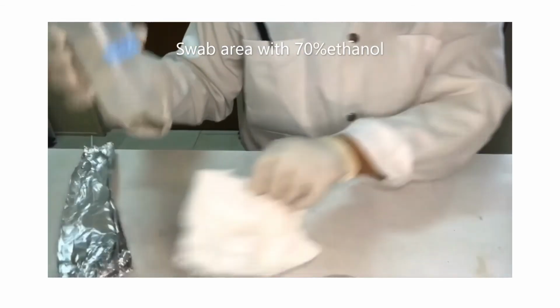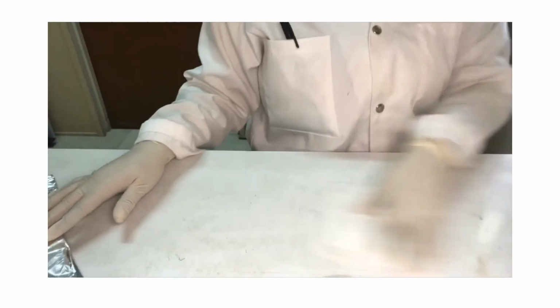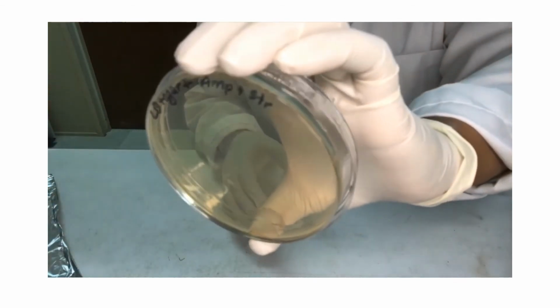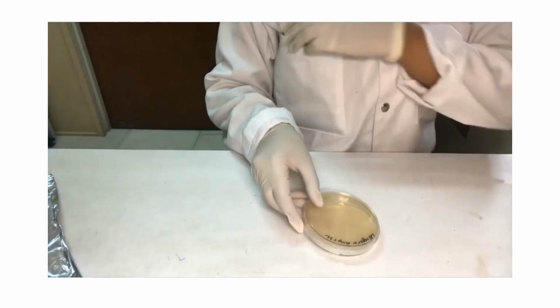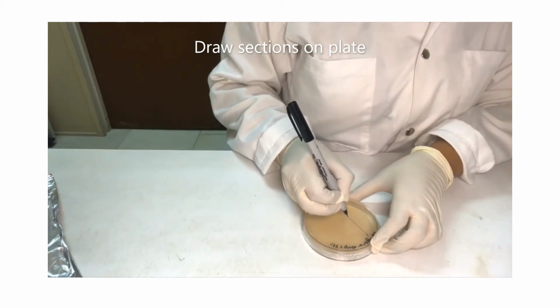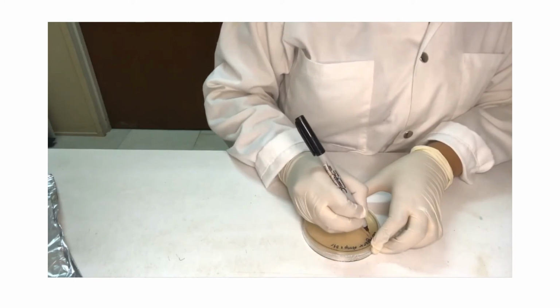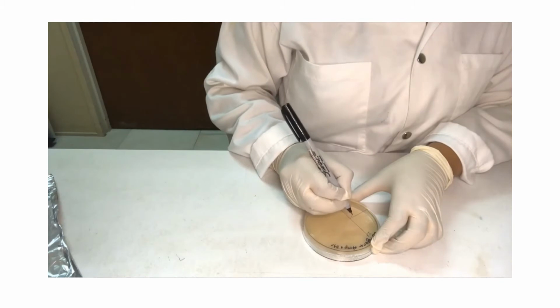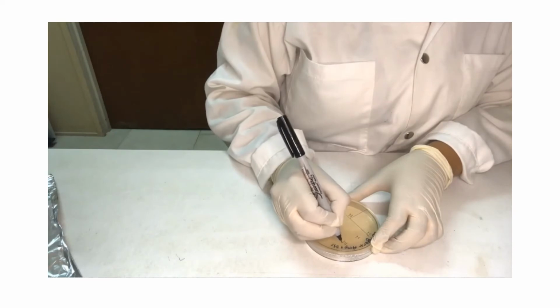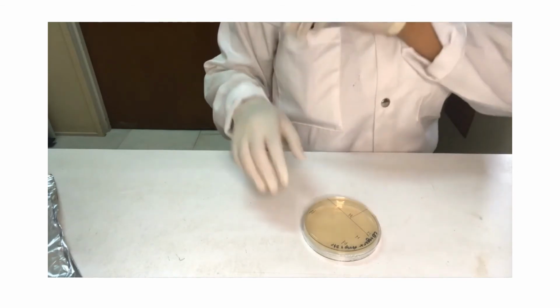The procedure for Lab Day 2 is now demonstrated. The workspace is first sterilized using 70% ethanol. Please observe the mating plate. The mating plate is a mixture of LB agar, strep, and AMP antibiotics. She then proceeds to divide the plate into 3 regions as illustrated in Figure 3. The areas on region 3 where she intends to inoculate strains 1 and 2 are also identified.